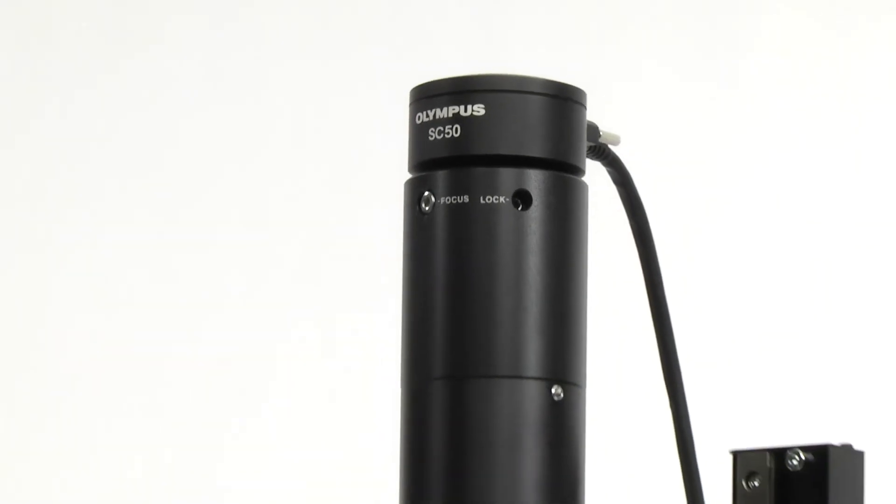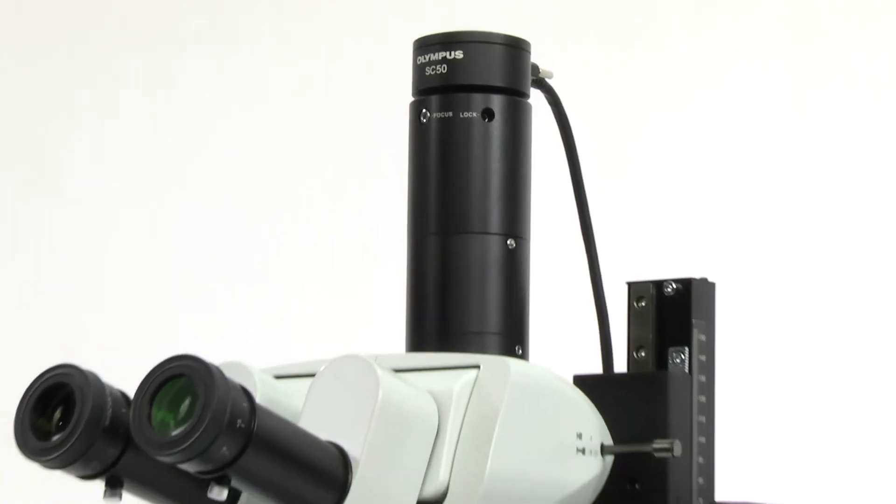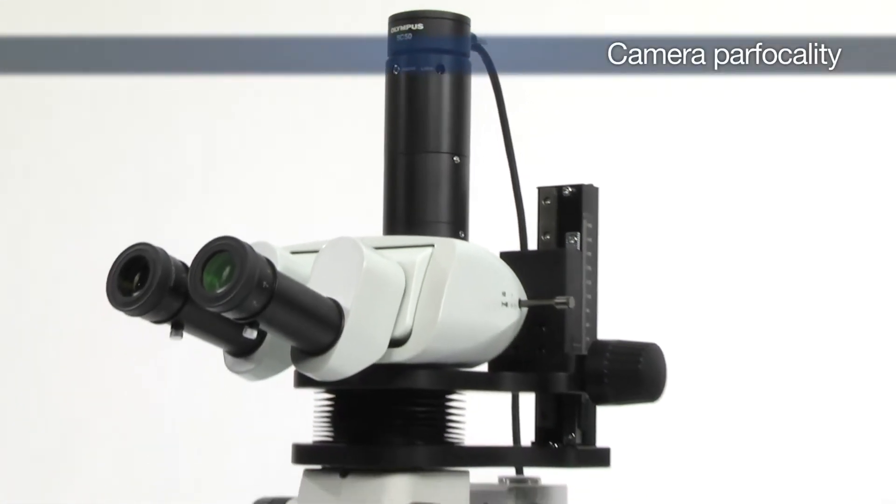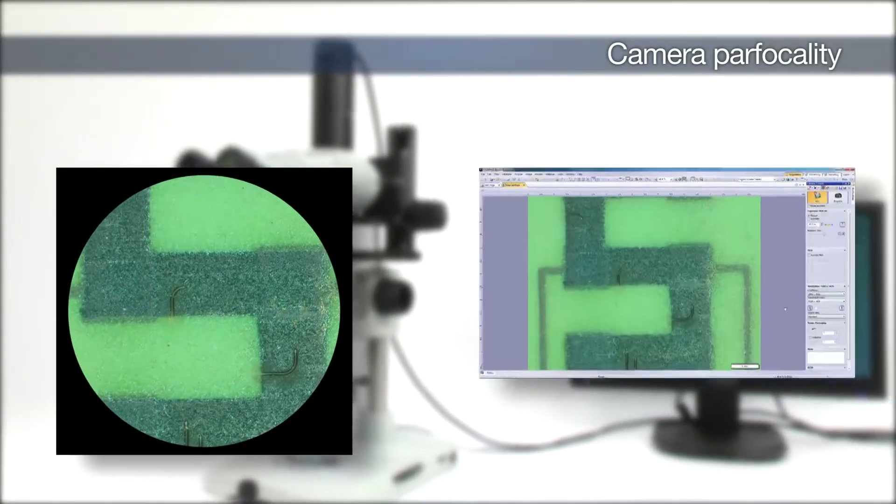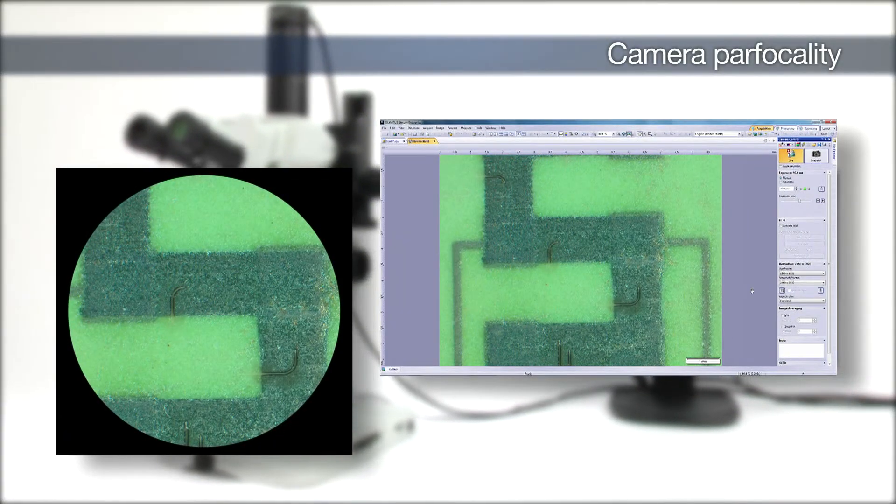For stereo microscopes equipped with digital imaging systems, proper camera parfocality is important to help ensure that the image viewed through the microscope and the image displayed on the monitor are in focus with each other.